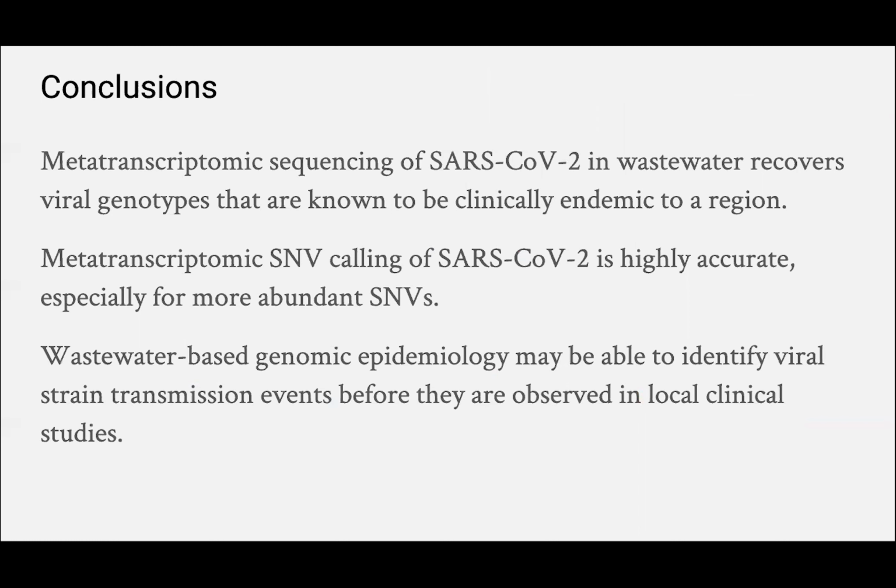it's really matching up with what's known from patient sequencing in the Bay Area, which is great because, and really depends on the fact that the Bay Area has enormous and very impressive patient sequencing efforts led by Chan Zuckerberg Biohub and the Innovative Genomics Institute, among others. And so it's great that with wastewater sequencing in a single sample, without relying on anyone coming to the clinic, right, or the delay involved there, we were able to see the same sorts of genetic genotypes that they've identified in patient sequencing in single samples.